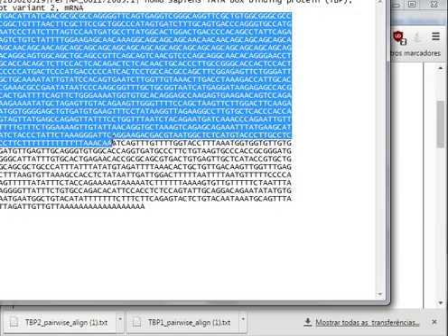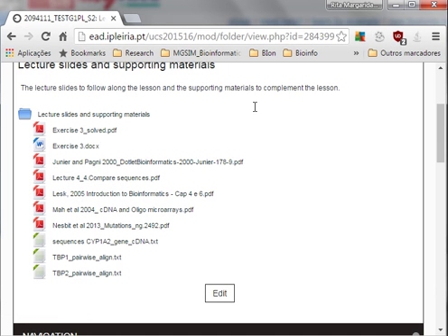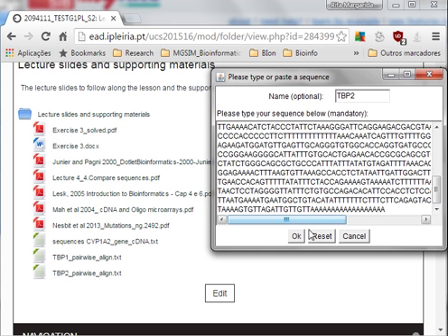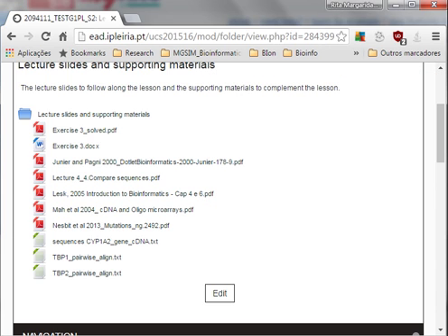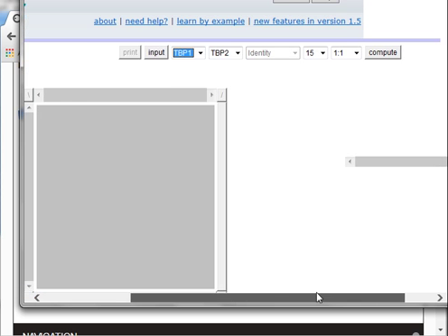And as long as you get the 2 sequences, Dotplot will allow you to perform a graphical view of what is corresponding between the 2 sequences. So what you have is that you can perform the alignment between TBP1 with TBP2.